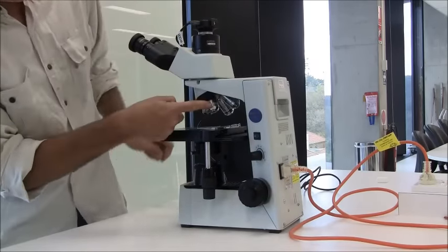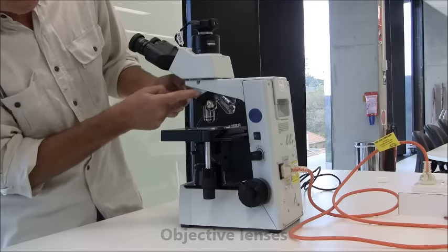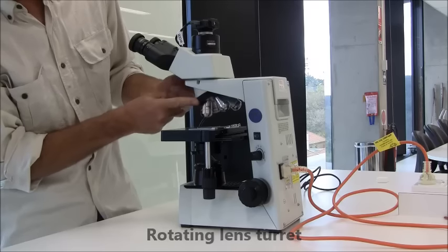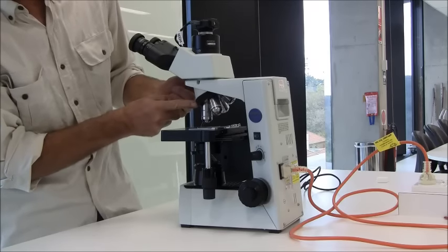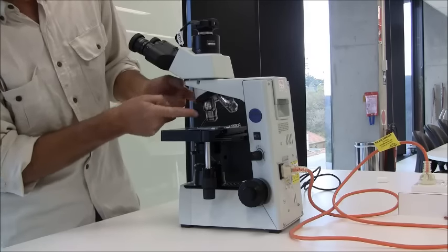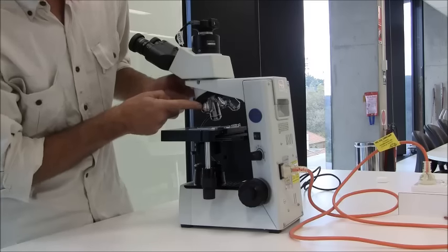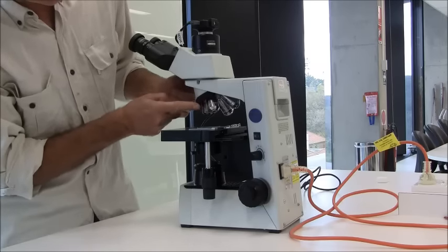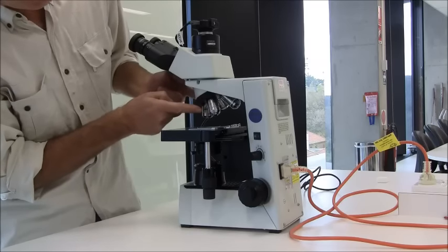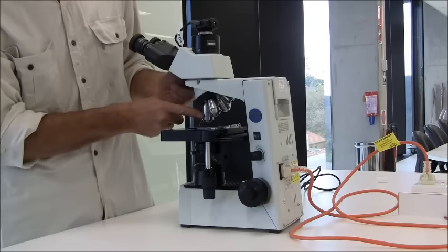Next, we have a series of lenses called the objective lenses mounted on this device called a turret. And you can select the objective lens that you want by rotating the turret around. You can hear it click into place. There are four lenses. The lowest powered lens has a red band, and that is four times. Then you rotate it to the yellow band, 10 times, and then to the blue band, which is 40 times. And generally, that's as high as we go.